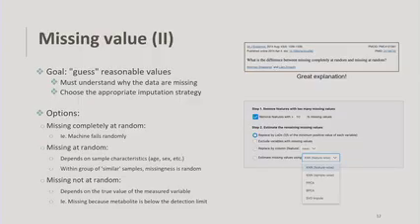So metabolomics data is mostly missing not at random because it's dependent on the actual feature that we're measuring itself. It's just a limit of detection issue usually. It's because the true value is maybe below our detection limit, and so that's why it's missing. And so we're usually going to try and replace that with values that are near the limit of detection when we're trying to do the missing value imputation. And so those are most of the methods that are in that screenshot right there.